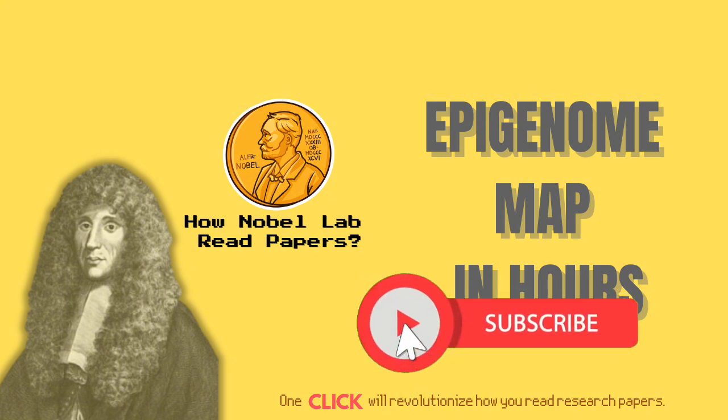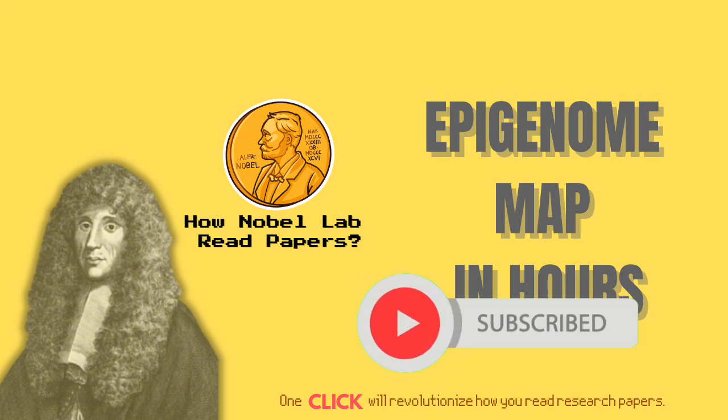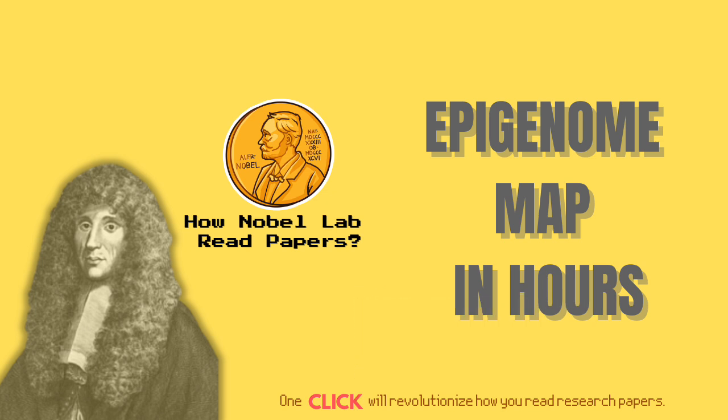And the protocols themselves were long, lots of steps, lots of chances for things to go wrong or lose your sample. Okay, so the authors saw this problem. They needed something fast, sensitive, low input, and ideally integrated, giving you the whole picture at once. Exactly. They wanted accessibility, nucleosome positions, and TF occupancy, all from one go.